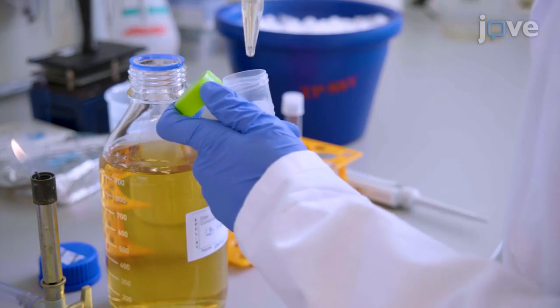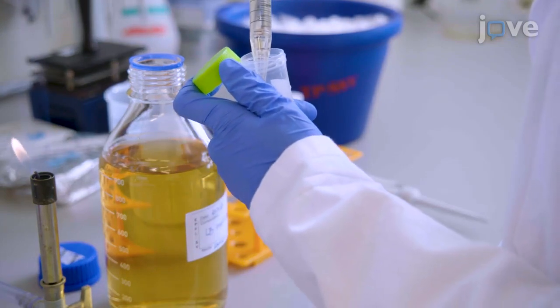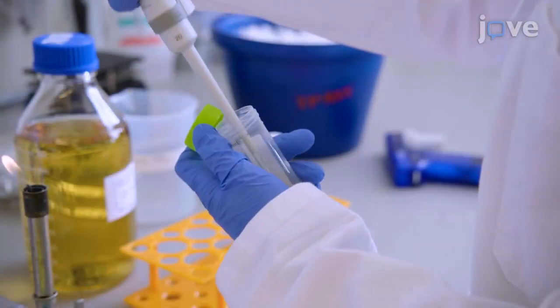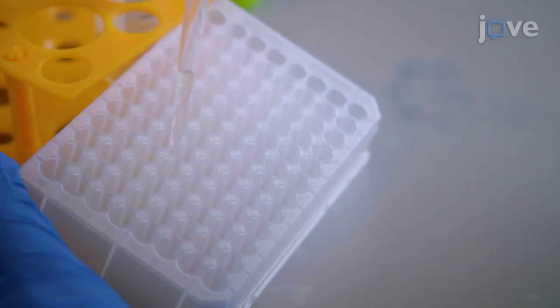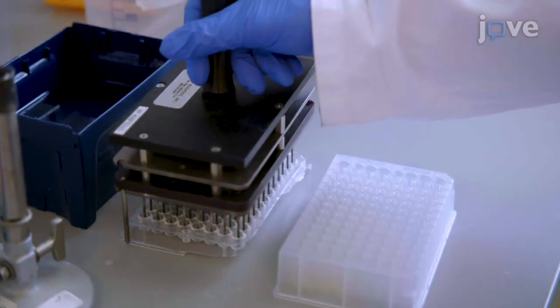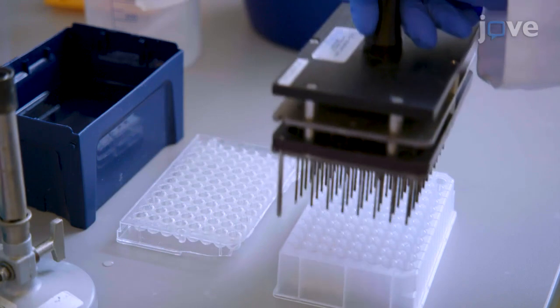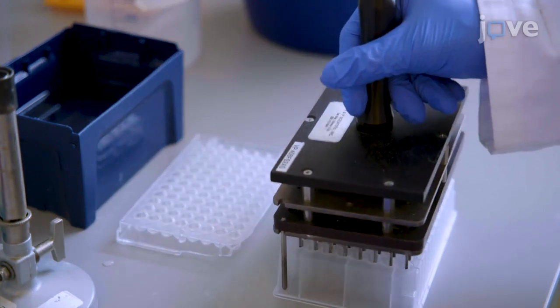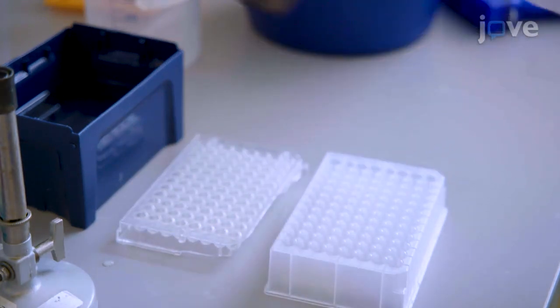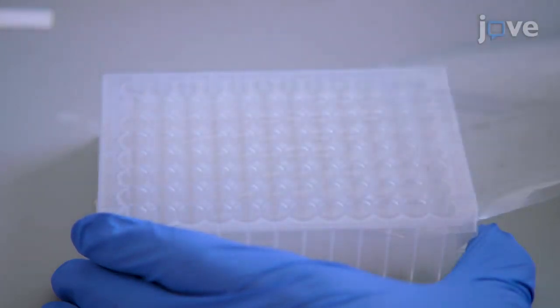Prepare the starter cultures by combining 20 mL of LB media with 20 µL of ampicillin. Add 300 µL of the media into 35 wells of a sterile 96 deep well plate. Inoculate each of them with its respective strain, except elongation factor thermo-unstable, or EF-TU, and seal the plate with a breathable membrane.